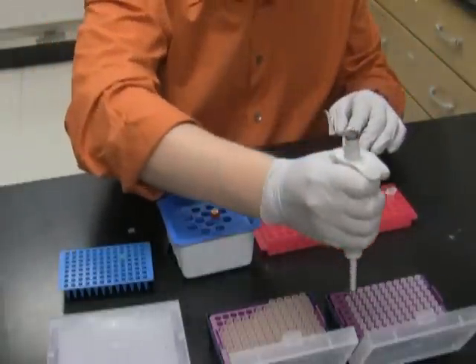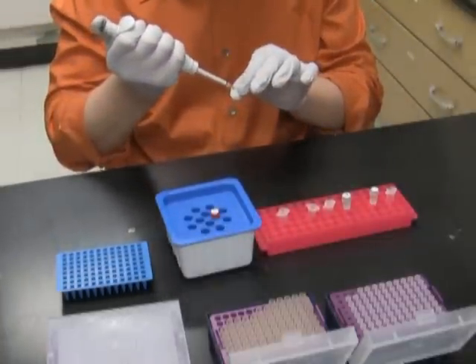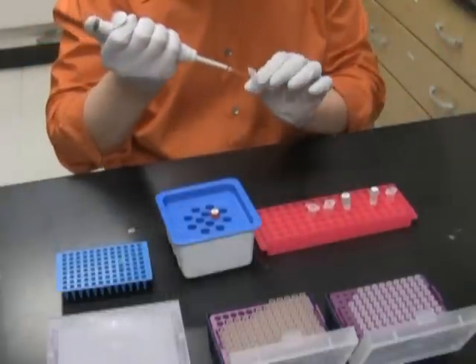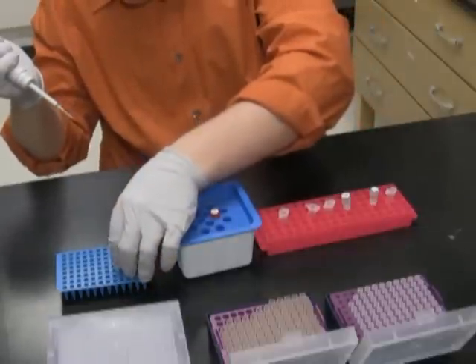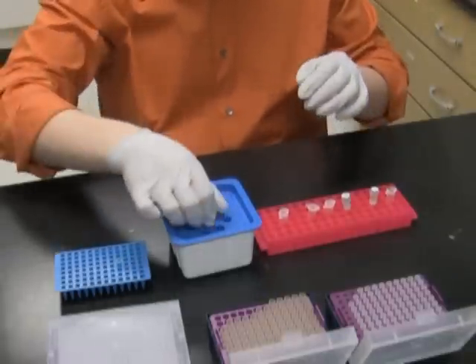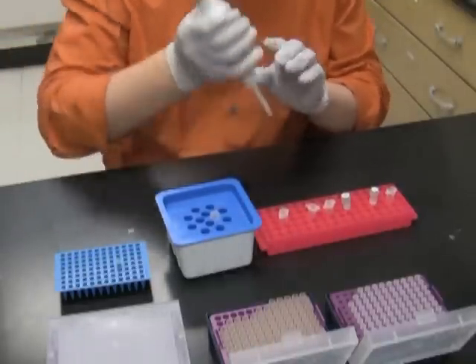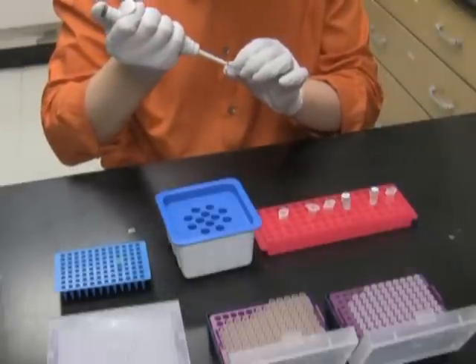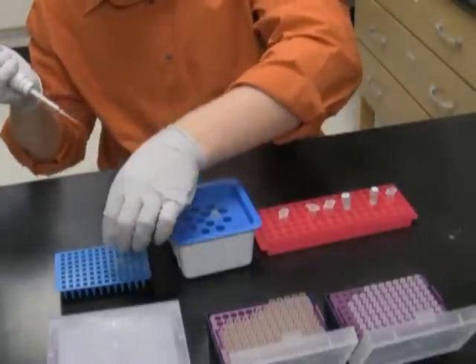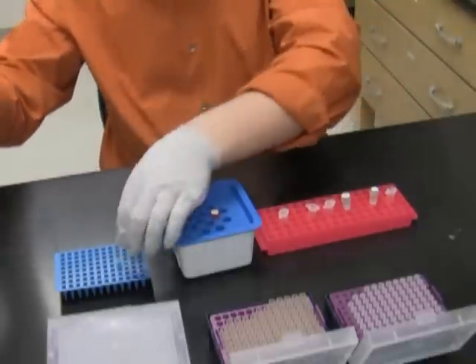1 microliter of reverse primer, 1 microliter of DNA template, and half a microliter of polymerase. Once everything is inside, I'm going to mix it up by pipetting up and down.